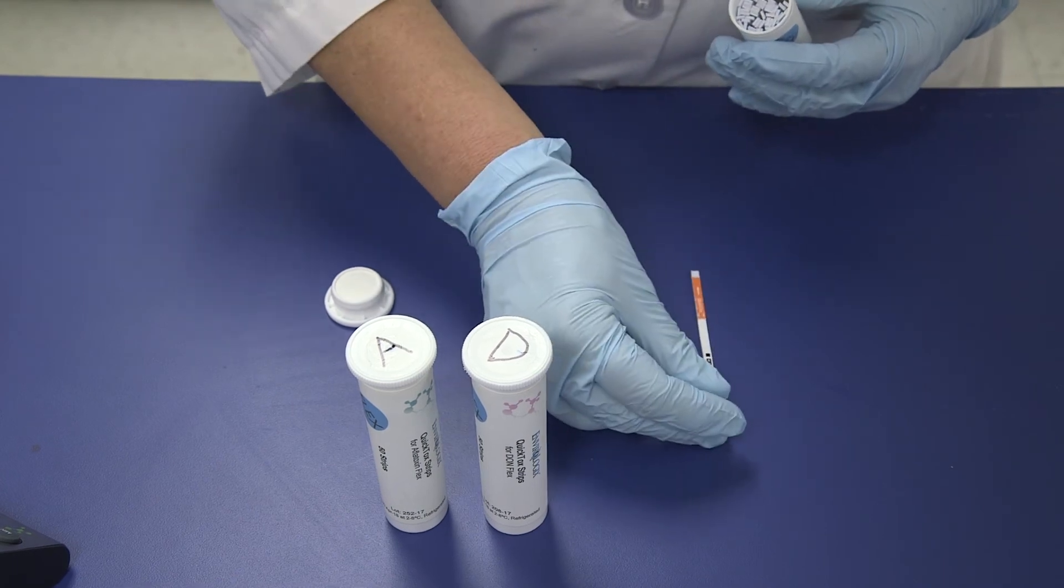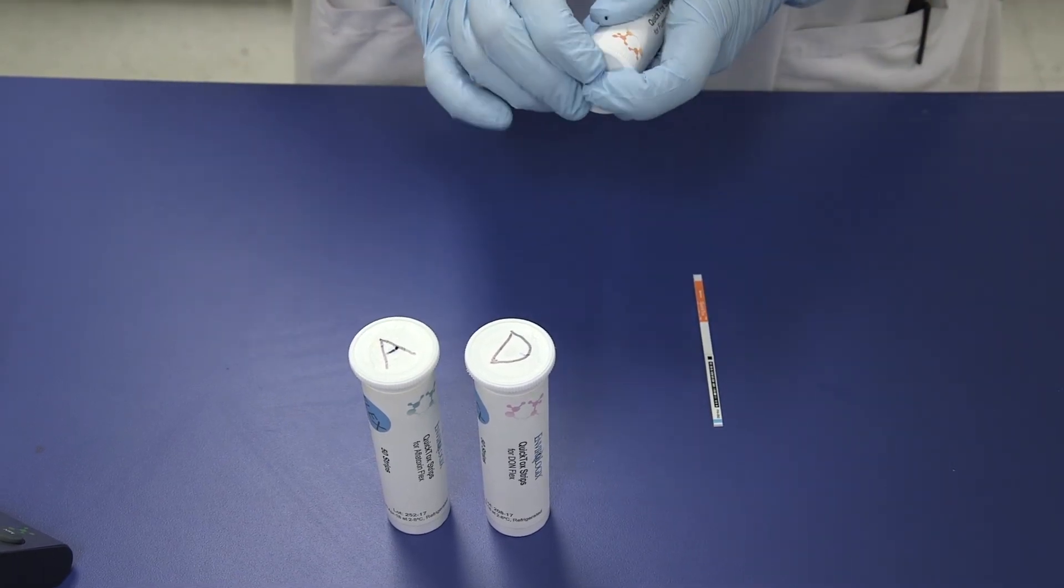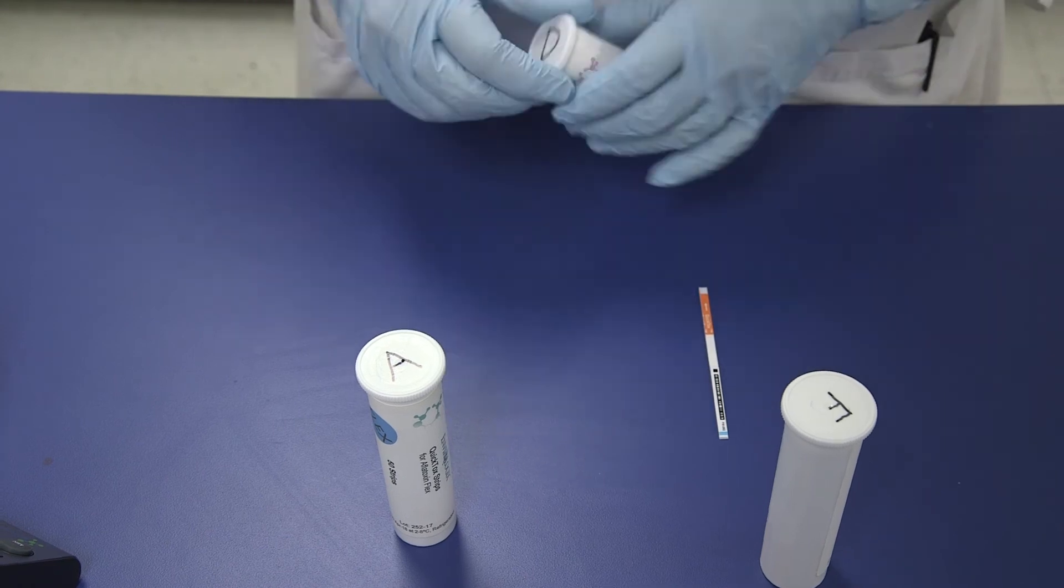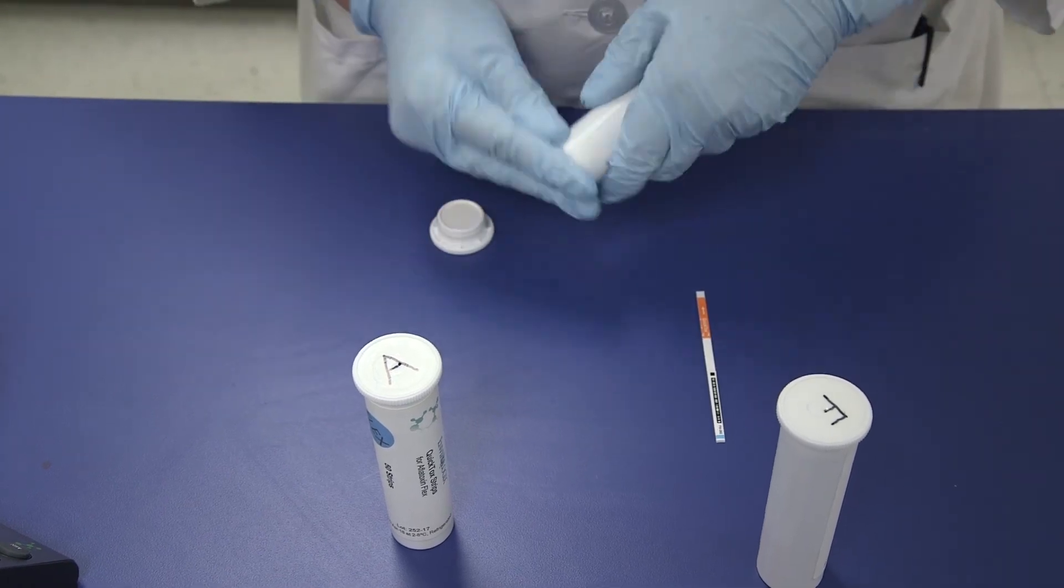You will need to remove the test strips from their canisters just prior to adding them to the reaction tubes. Immediately reseal the canisters after removing the strips.